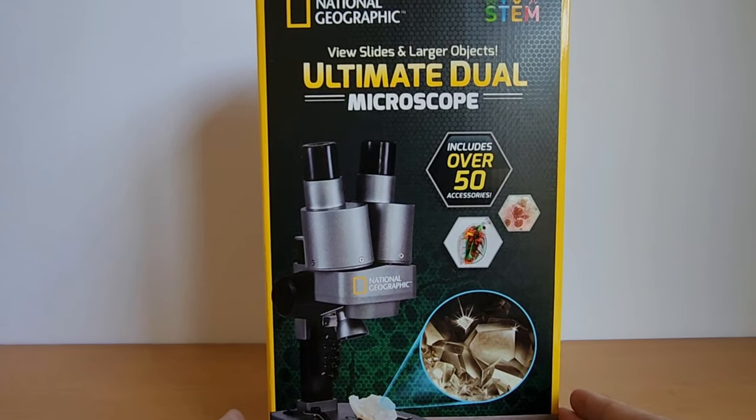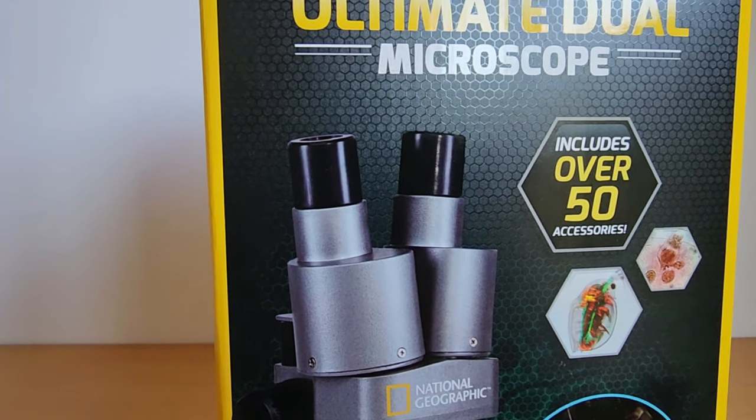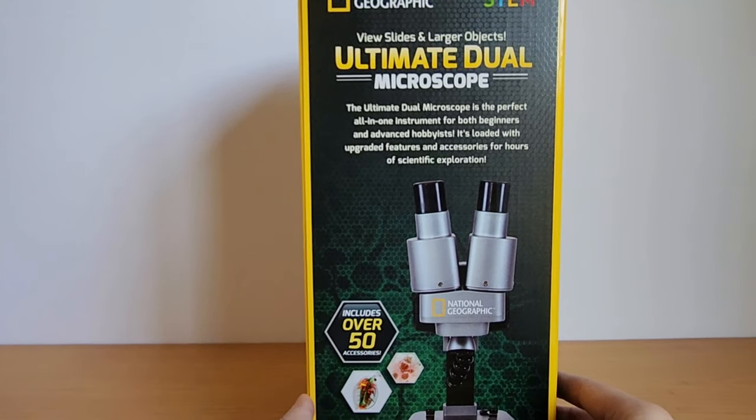This is the National Geographic Dual LED Kids Microscope. This is a wonderful STEM science microscope to get kids started into looking into the microscopic world.